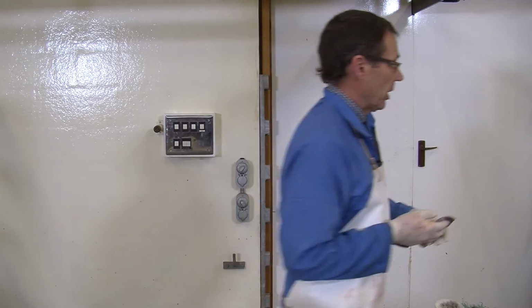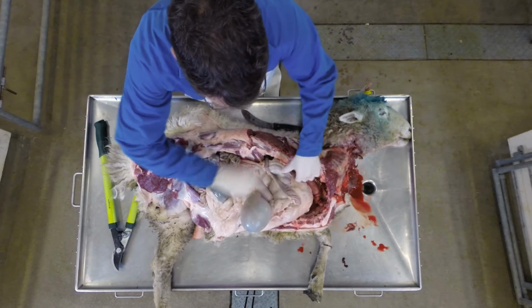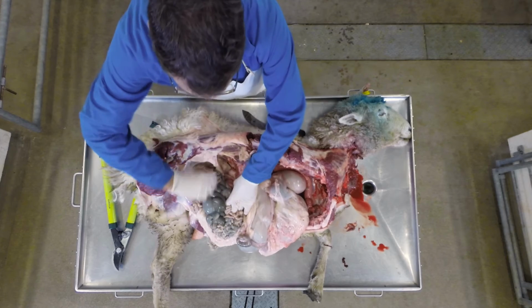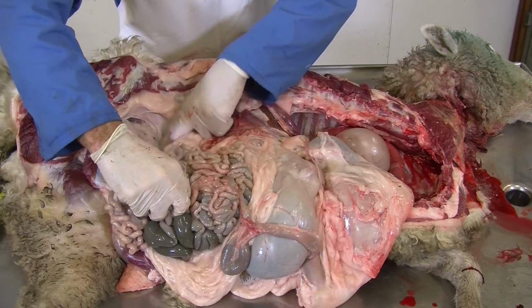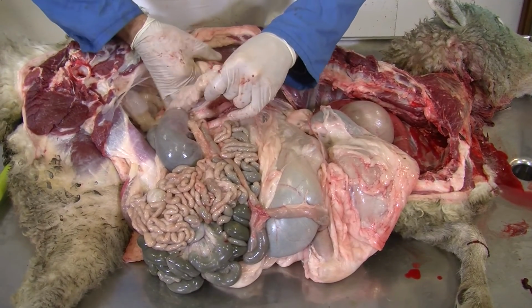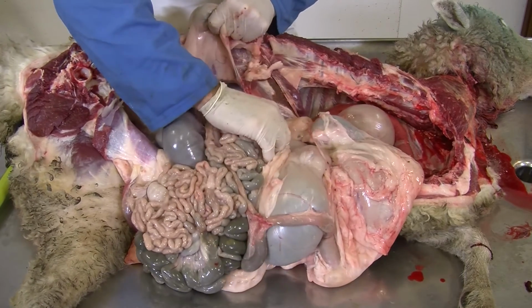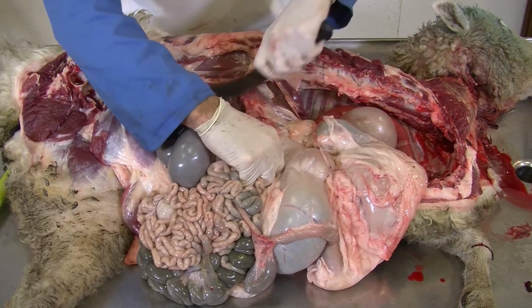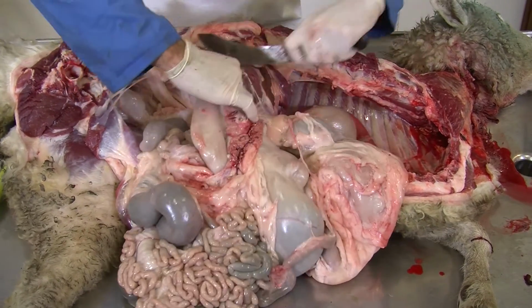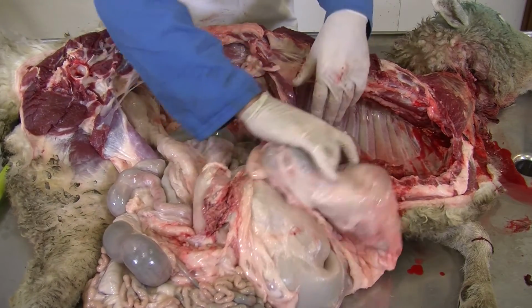So that's the spleen. And really everything else that we have here, I'll just push it over, push it out. This is all gastrointestinal tract. So this is, apart from fat, well, there's the other kidney. This is all the digestive tract.